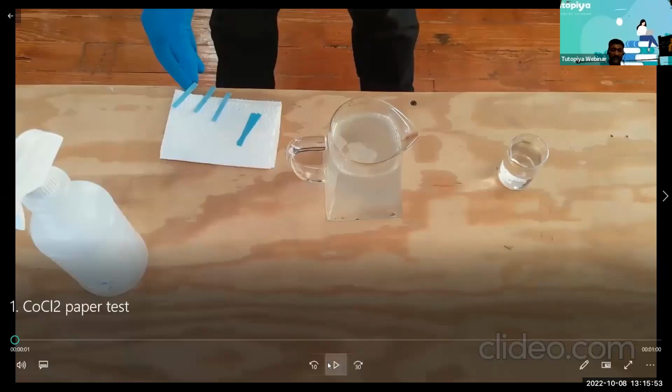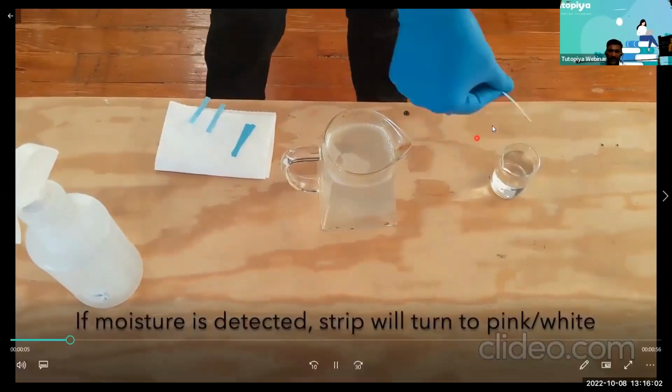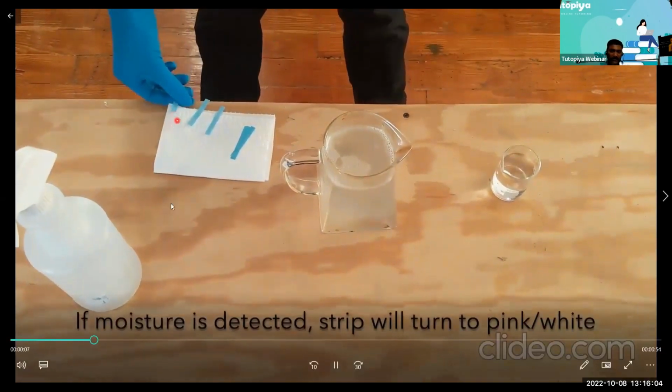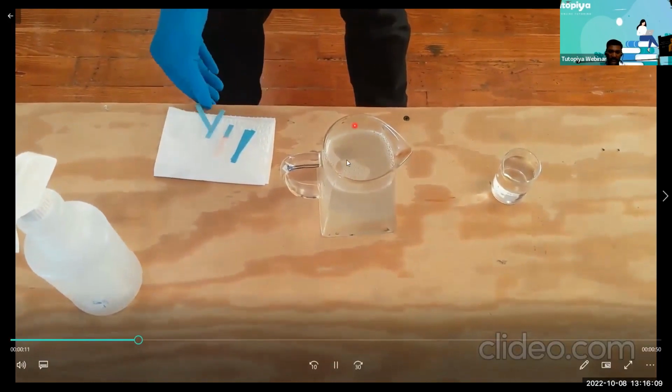Okay, right. Now can you all see this? This is the test to detect water by using cobalt chloride paper. This is the blue cobalt chloride paper. When I dipped it in water, it turned pink. Or this is hot water and there is some water vapor coming up, some steam on the top.